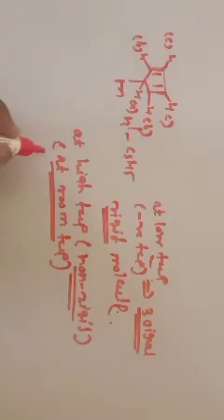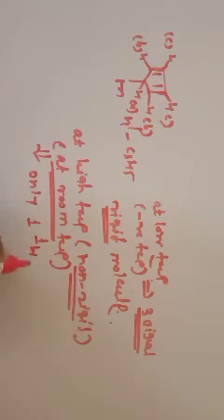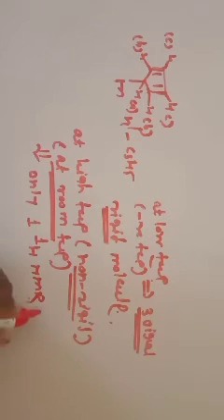And at high temperature we get only one H1 NMR signal for the cyclopentadienyl protons. At low temperature, that is negative temperature, the molecule is rigid and we get 3 signals.